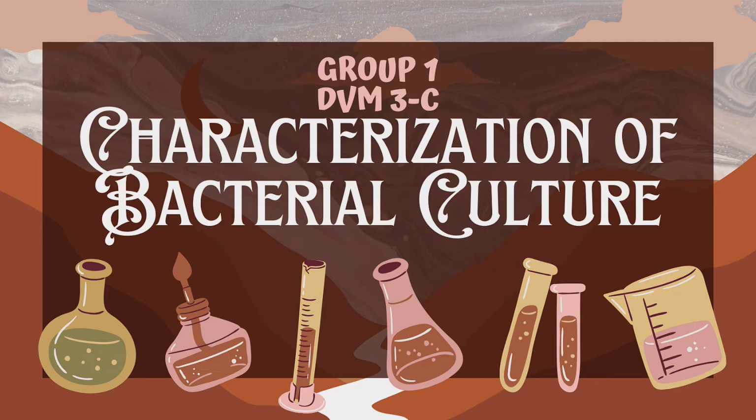My name is Rastin Jade RJ Beramo, and we are group number 1. We are here today as a group to demonstrate how to characterize bacterial culture on agar plates, agar slants, and nutrient broth. Without further ado, let's get started.